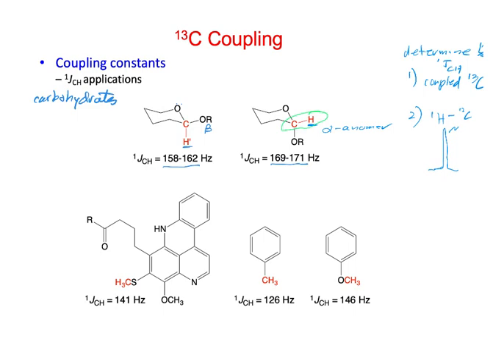But the protons that are actually attached to C13 atoms would be split, and so we would get some small peaks down like this. And this part would be the proton attached to C13.